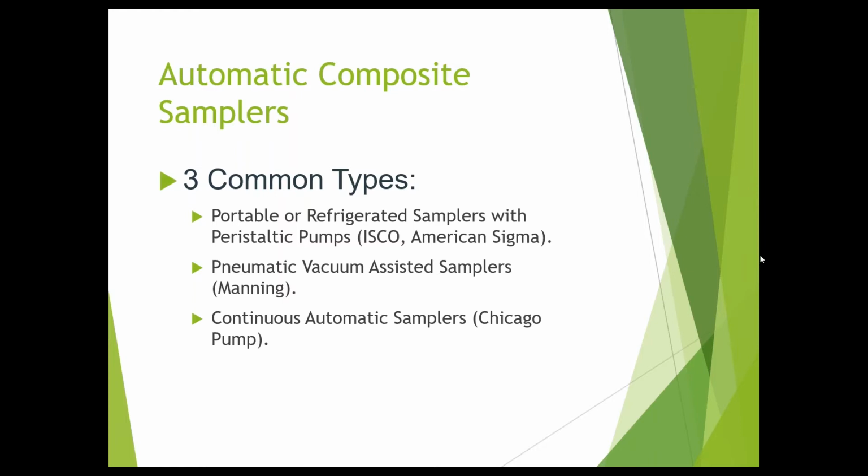I broke my heart once. I set my sampler, I went to run it, and I watched the water come up the tube, and it slowed down, and it slowed down, and it slowed down, and then it stopped. And all I needed was an extra 6 inches, and I couldn't get it. So that is something to look out for with peristaltic pumps.